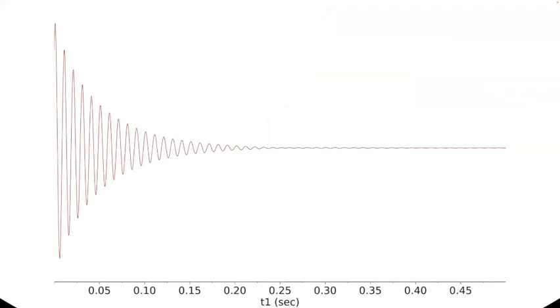When that happens, that nucleus generates a signal, like this one that was collected on a water sample or a D2O sample in a 600 megahertz magnetic field with an offset of about 100 hertz.